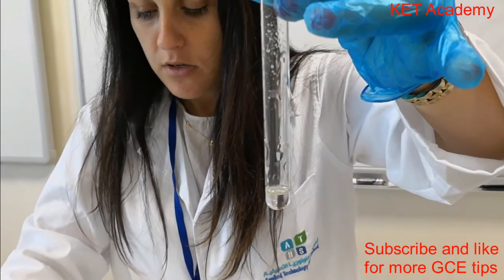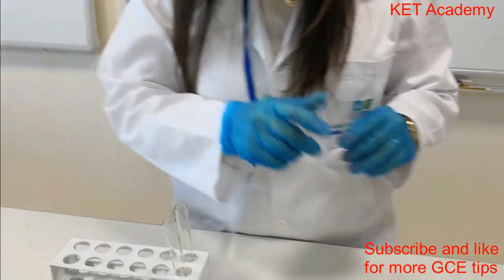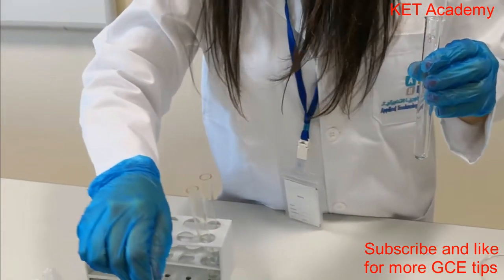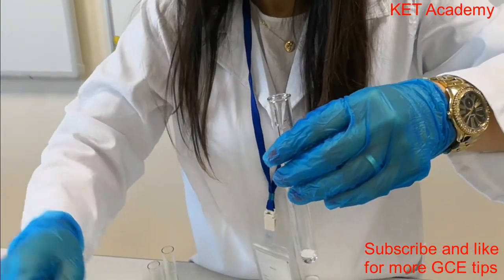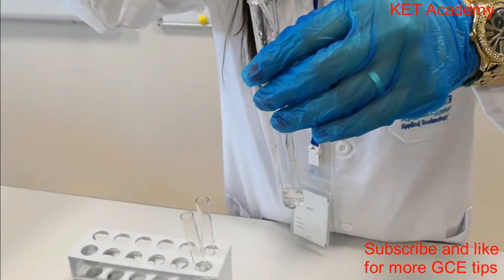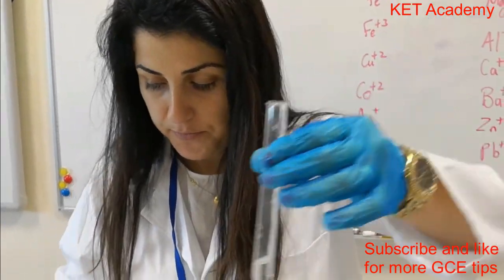Again, no precipitate. Now we will try the sodium cation. With the hydroxide solution, no precipitate.